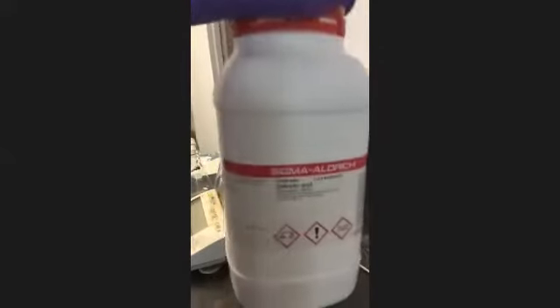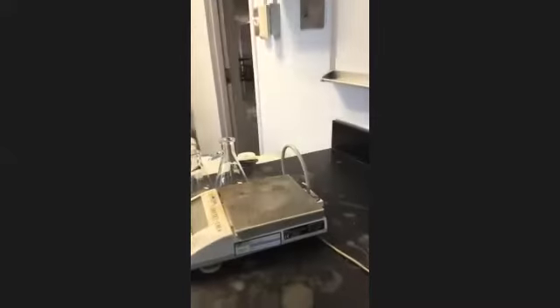Let me get the camera. All right, I need everybody that's zooming, everybody that's here, look on the handout. You see that block that says molecular weight for salicylic acid? Put this number in there: 138.12 grams per mole. That way, when you weigh out the 138.12, did y'all hear that on Zoom? Salicylic acid molecular weight is 138.12.